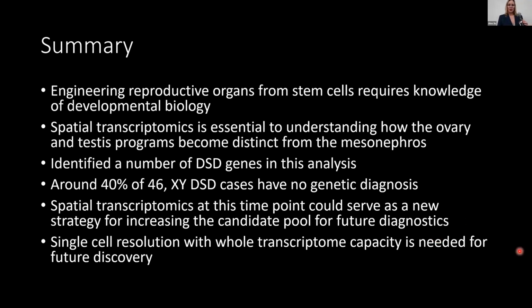We think spatial transcriptomics at this time point could serve as a new strategy for increasing the diagnostic pool for these patients. And we do believe that the next step, even though this was a review of how we view spatial transcriptomics, is to go down to single cell resolution to see how these different cell types are emerging.